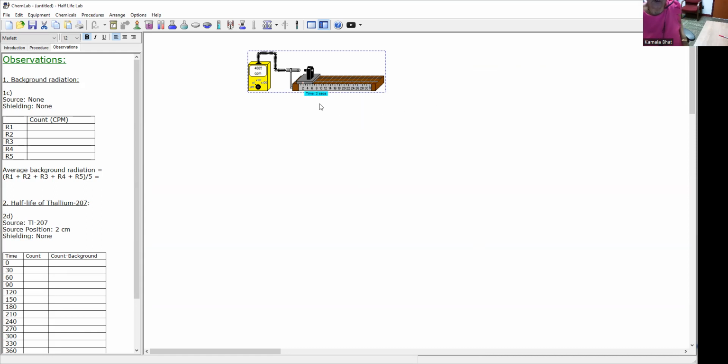As the timer moves, it's going to move very fast. When it comes to 30 seconds, keep an eye on that timer, and record the 30-second reading while the timer still proceeds on. So now the time in seconds is 24, 25, 26, 27, 28, 29, 30, and it's 4525. So you write it down over here, 4525, and then continue for the next.